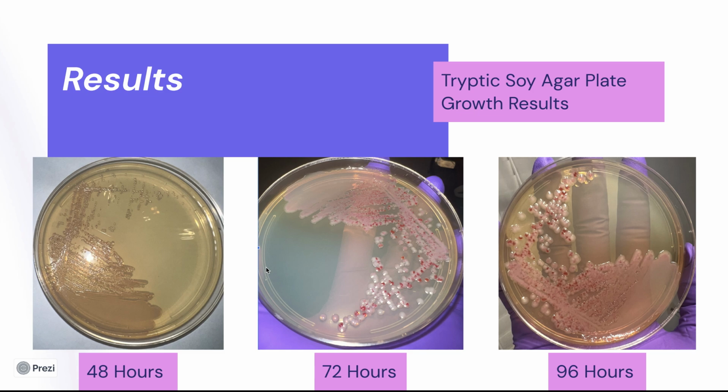Looking at the beginning of the streak, you can see that it's difficult to see what colony types were present as they were more like one on top of another. When looking at the end of the streak, you could see that 2 different colonies are separated distinctly because of their color differences. I could accurately point out which colonies were Serratia, because those were more red or pink in color, versus the ones that were Micrococcus, which had a little bit more of a yellow color. Because of this, it signified that the experiment was performed successfully.